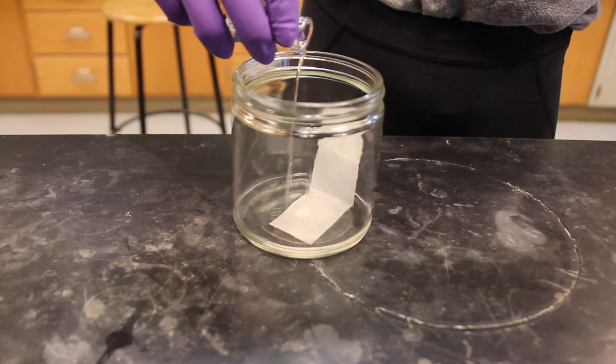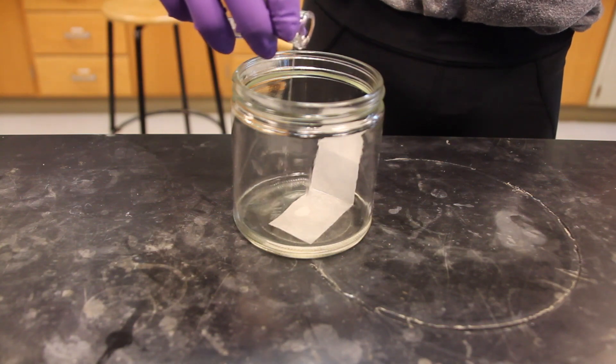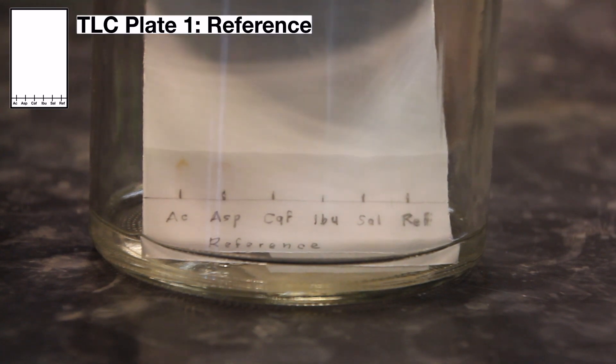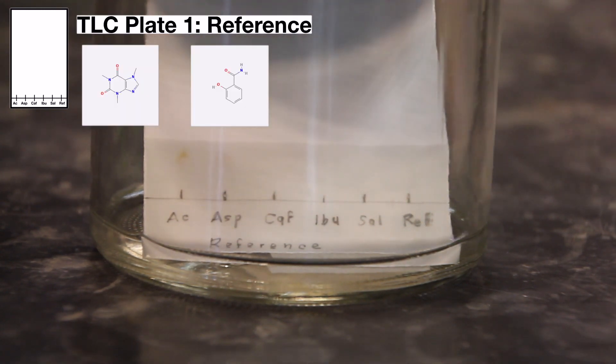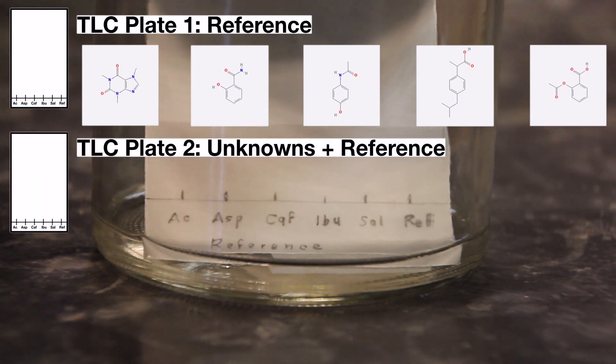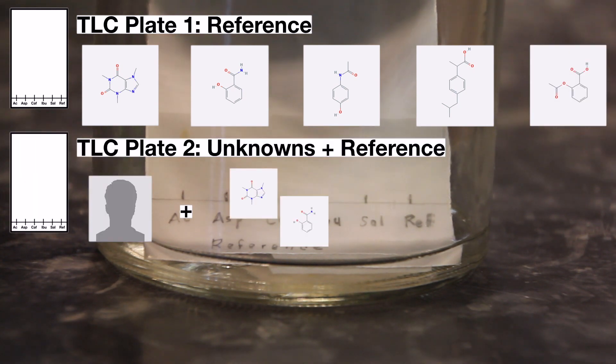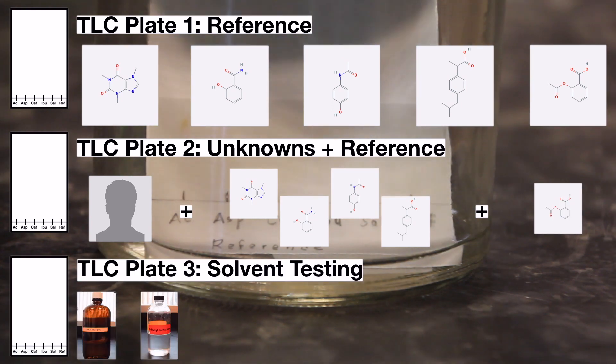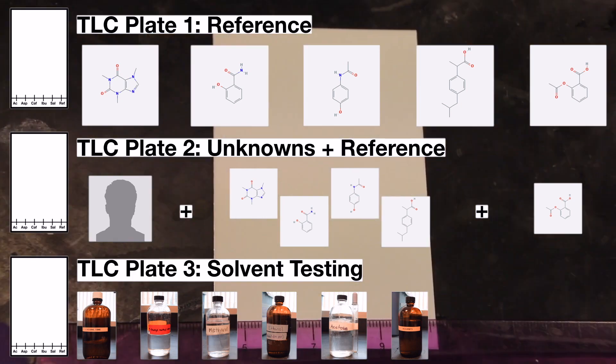Next, pour 2-butanone into the jar until it reaches a depth of about 0.5 cm. One of your TLC plates will be used to run the separate reference compounds to determine their individual RF values. Your second plate will be used for the chromatography of a mixture of the known compounds plus the unknown. Your third plate will be used in a team exercise to test the effect of different solvents on RF.